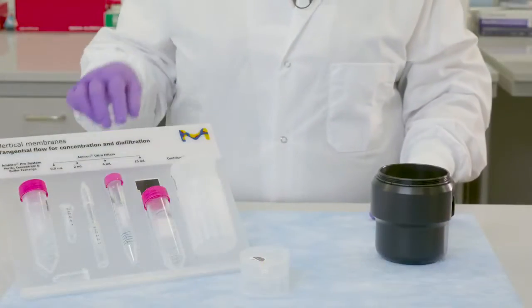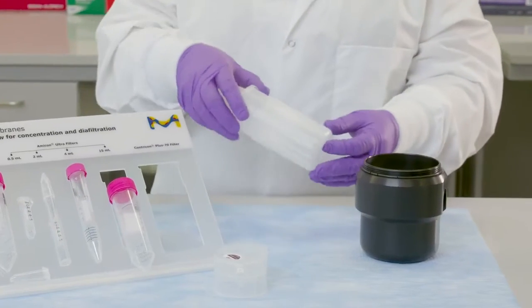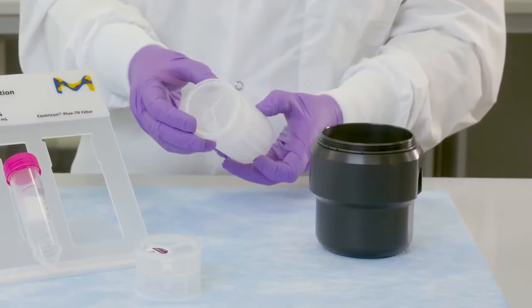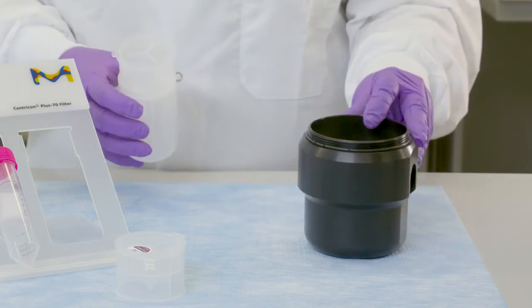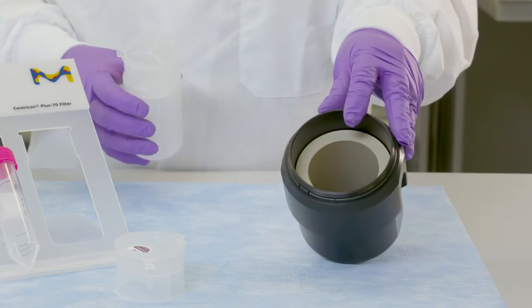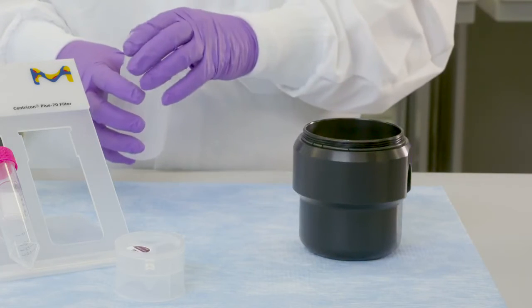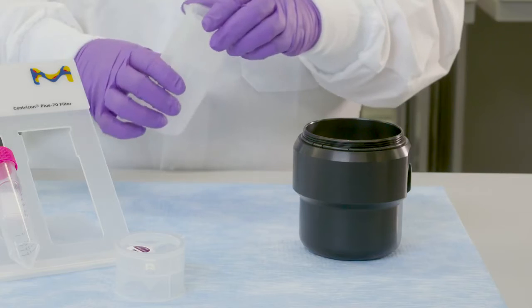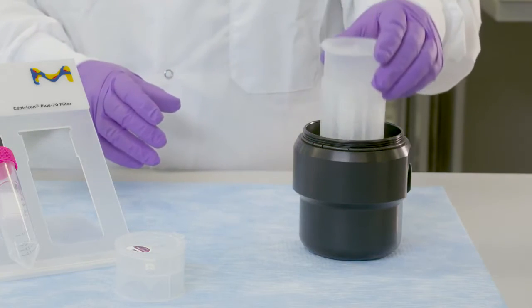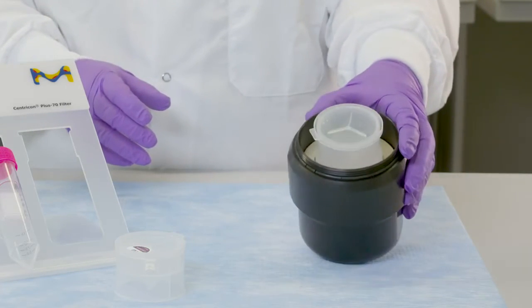The Centricon Plus 70 device has a diameter of 60 millimeter, length of 121 millimeter, and has a flat bottom. The rotor used is a swinging bucket rotor with adapters capable of handling 250 mil bottles. Make sure the device is fully assembled and snapped together. Do not use a fixed angle rotor as your sample may leak out of the cap.